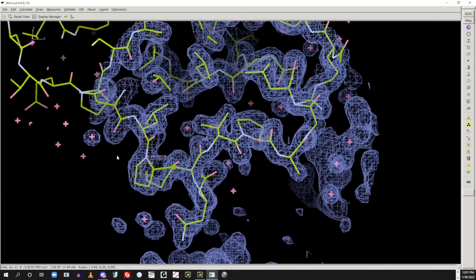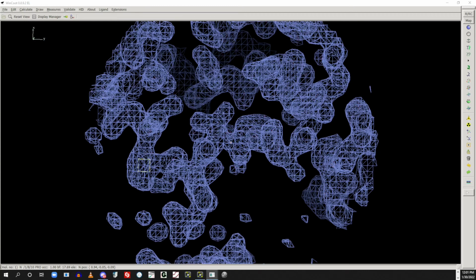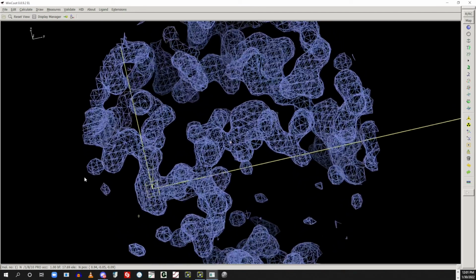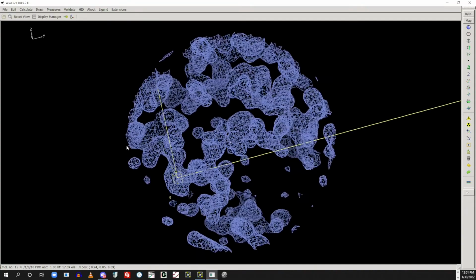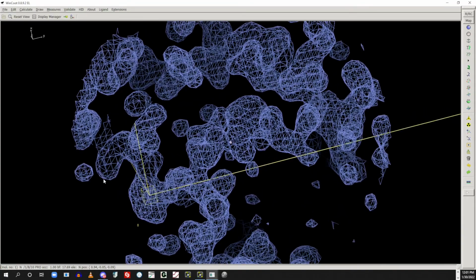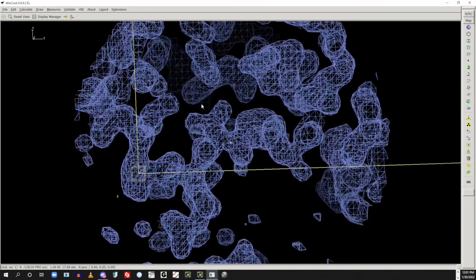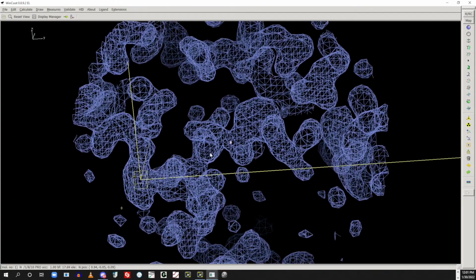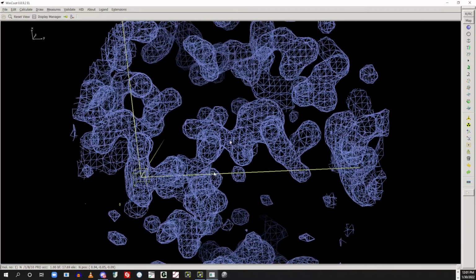Okay, to go back a step and reiterate what I mean when we're solving the electron density equation, we're again looking at our model and map that we have here. If I were to remove the model, which is the structure, and put the unit cell back up with the origin right there, and zoom out a little bit, basically what we're doing with the electron density is going through the equation to get a 3-dimensional representation of where there's positive electron density and how much there is at each XYZ position, using that triple summation wave function that I showed earlier, which I will get to in more detail in a few minutes.